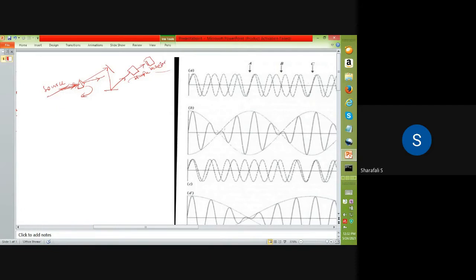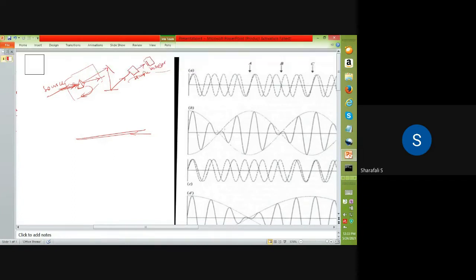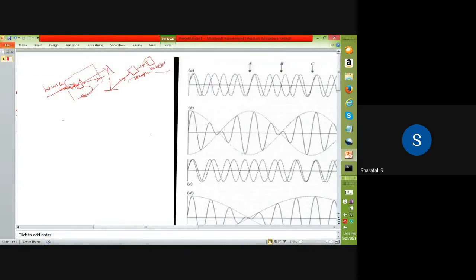So this is a process, and the main drawback is happening here because we have to rotate the prism to get each and every frequency. And we have to plot it, for example, if you are having this kind of a spectrometer, and convert all those frequencies into centimeter inverse, that is into wave number, and use that wave number to plot this IR spectra.